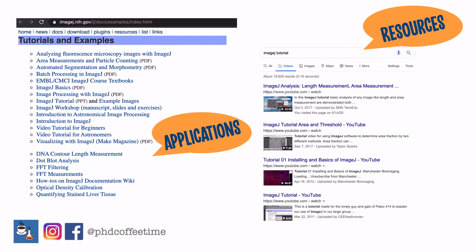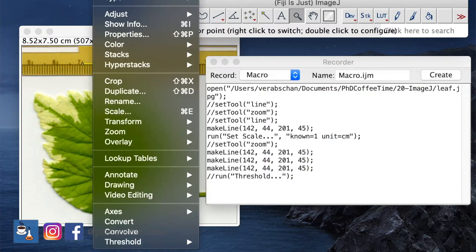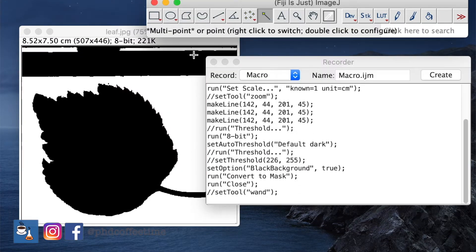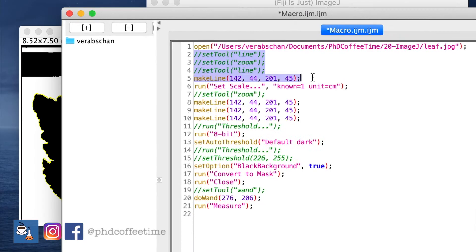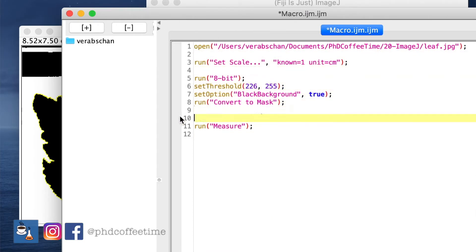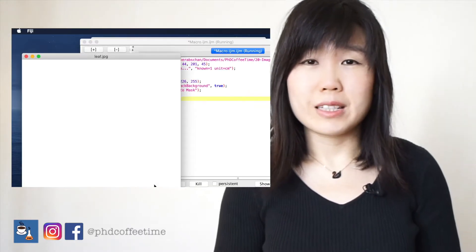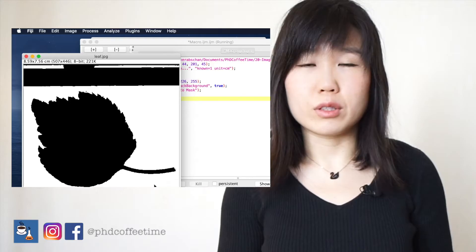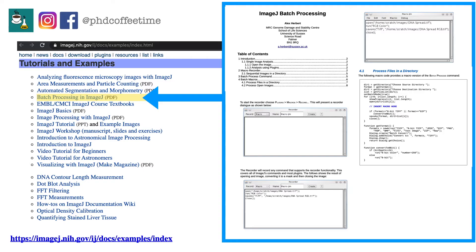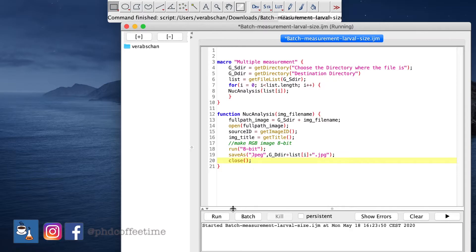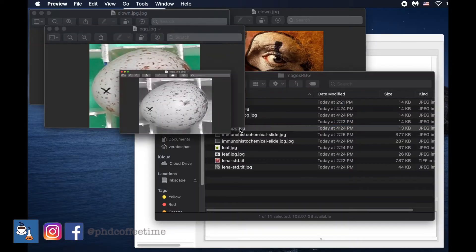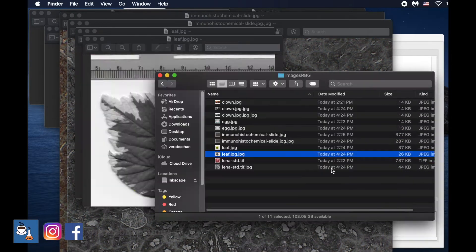You'll also be able to identify resources out there — blogs, videos, and forums. I'd also like to cover my biggest discovery in recent years: the macro features in ImageJ, which let you automate image analysis and save a lot of time. I'll also share a script for batch processing an entire folder of images, which has saved me a ton of time.